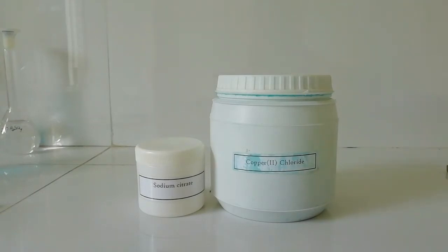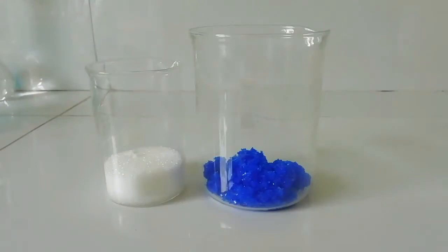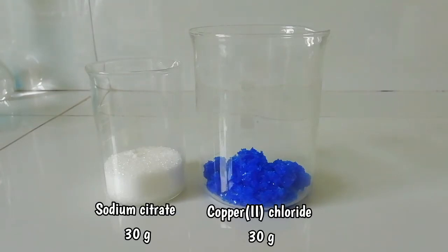To start with the reaction, we need two chemicals. You can see here copper chloride and sodium citrate. I've taken about 30 grams of each chemical: 30 grams of sodium citrate and 30 grams of copper chloride.